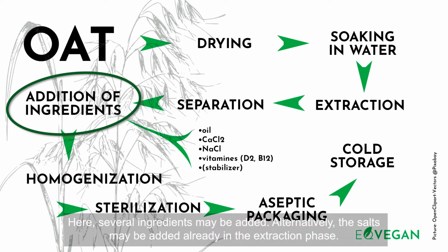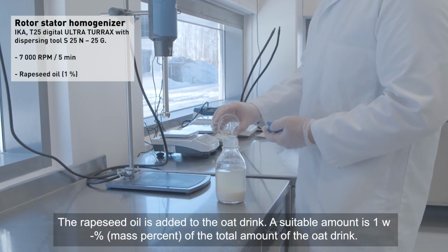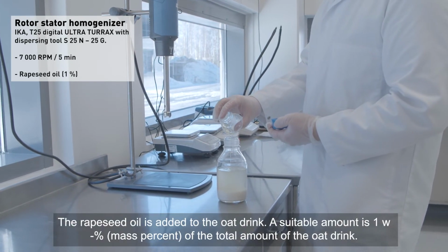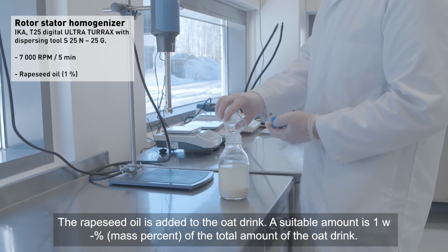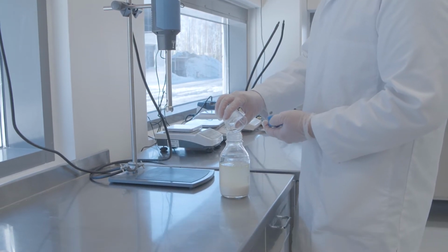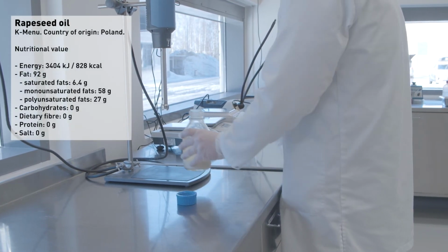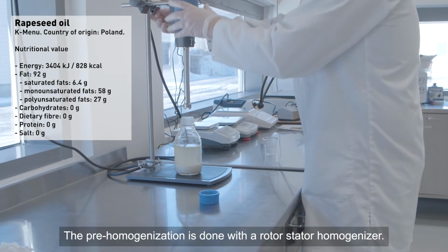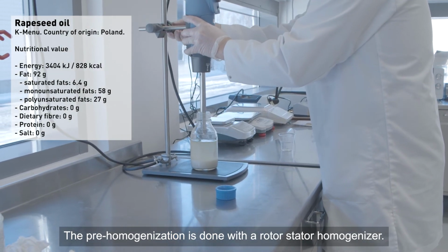Here, several ingredients may be added. Alternatively, the salts may be added already in the extraction phase. The rapeseed oil is added to the oat drink. A suitable amount is 1 mass percent of the total amount of the oat drink. The pre-homogenization is done with the rotor stator homogenizer.